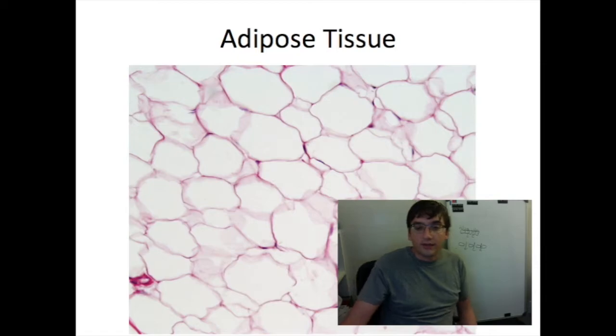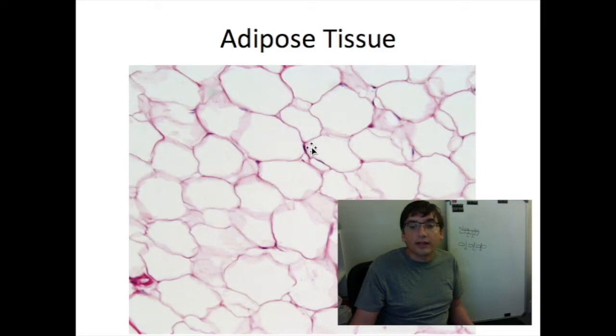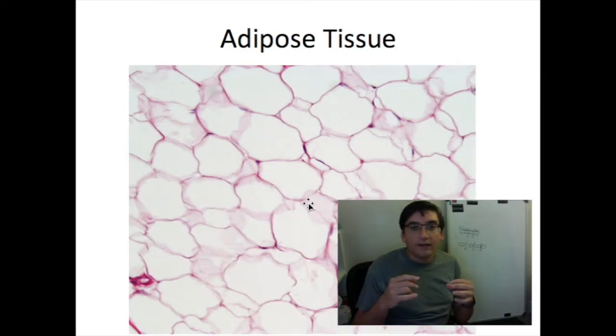And so the different connective tissues: this is adipose tissue. This is actually the exception. This is the only one of the connective tissues that doesn't have an extracellular matrix. You can see the cells are kind of attached together, but they're full of that fat vacuole. That's why it looks like it's clear. This is a giant fat vacuole. The nuclei are squeezed into little bitty corners of these cells. So the connective tissues are united by having a similar function of providing material strength or flexibility, in this case, padding provided by adipose tissue. Your adipose tissue protects many of your vital organs and so forth.